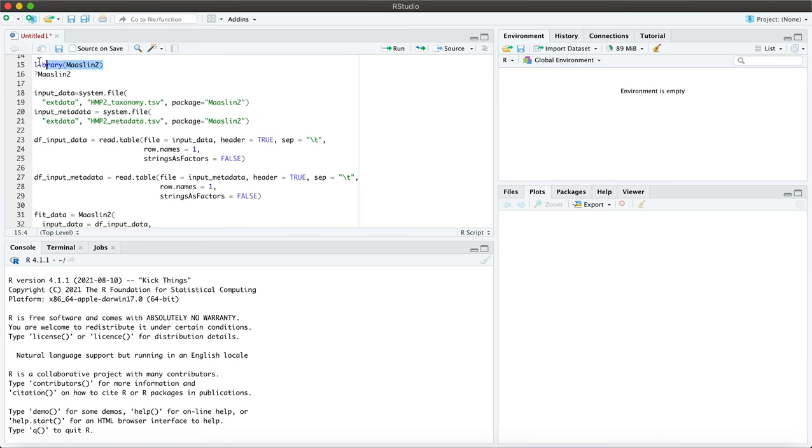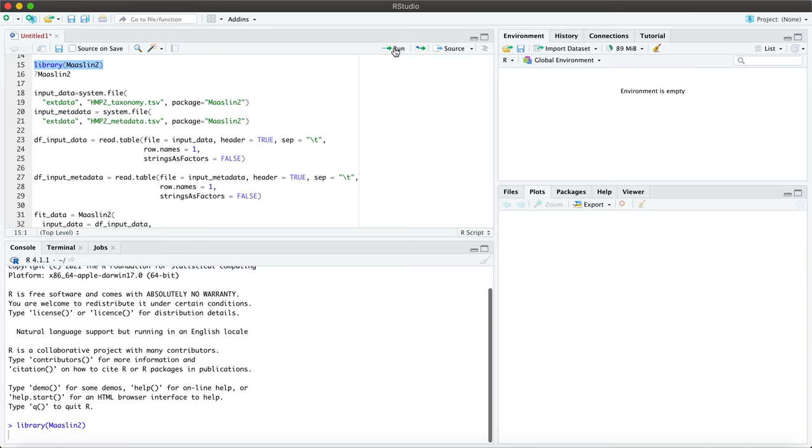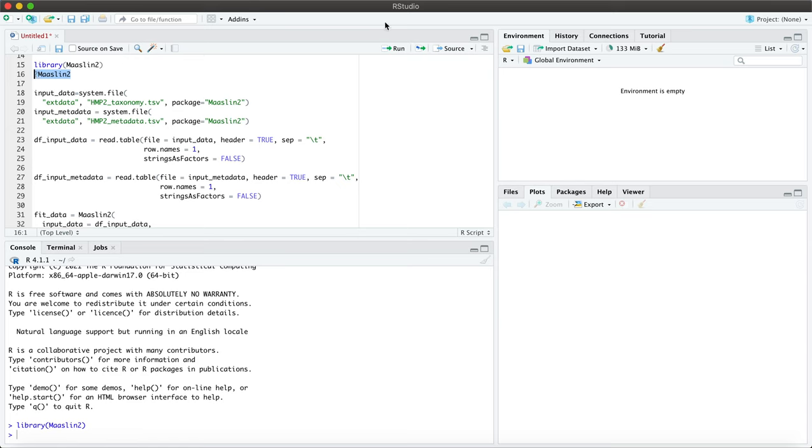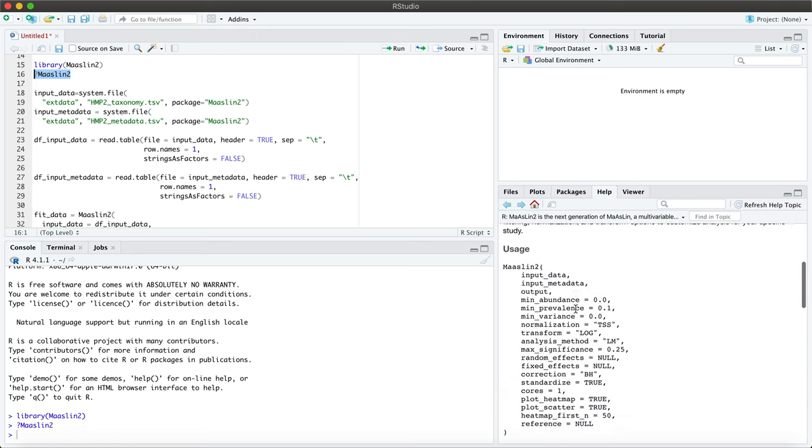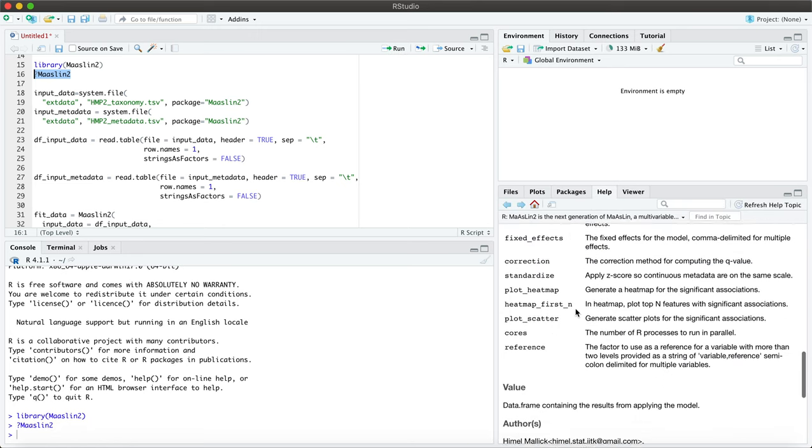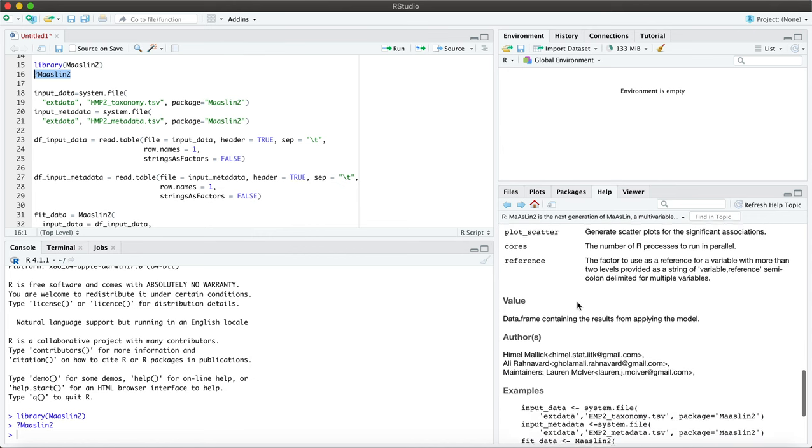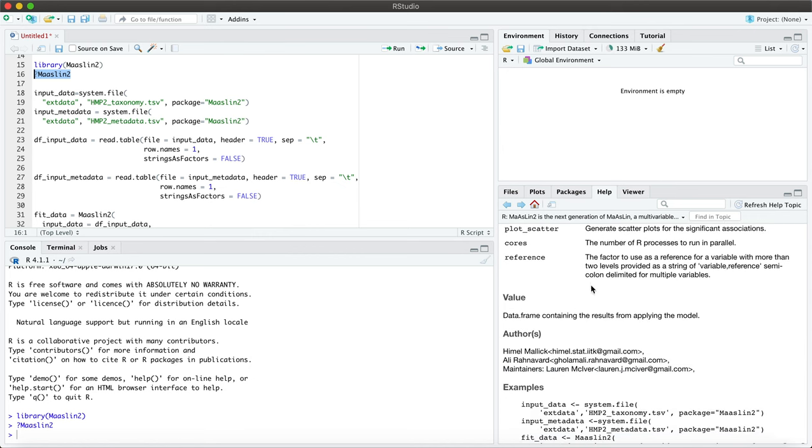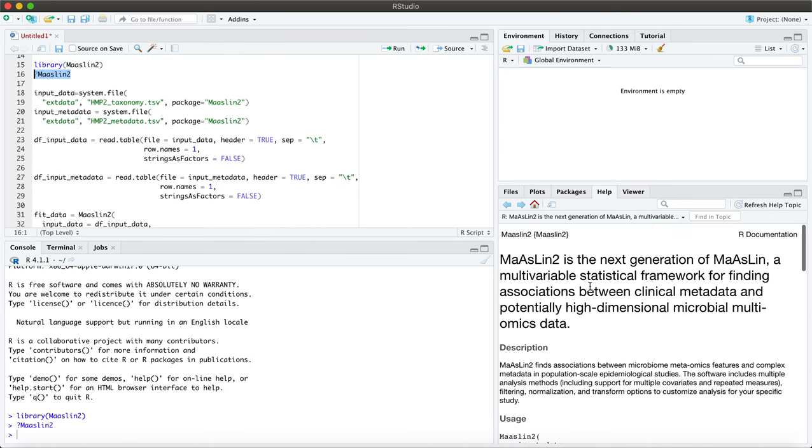Of course we would want to go ahead and load the package into the R environment. And as with any package, if you insert a question mark in advance of the package beside it, then you would be able to get more specifics about the package and you can go through that under the help window.